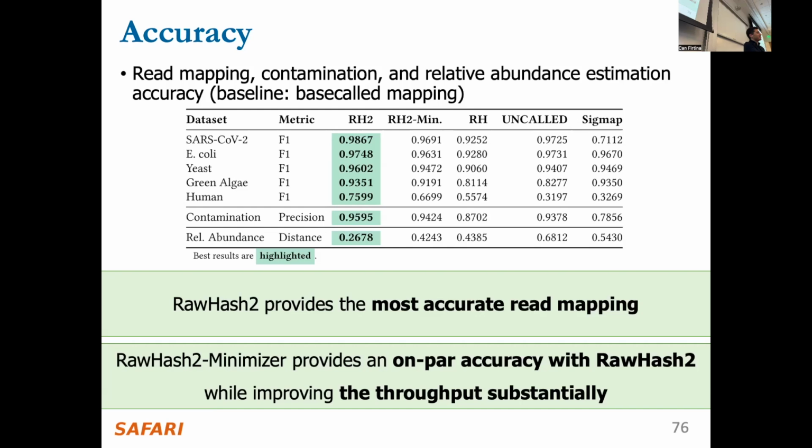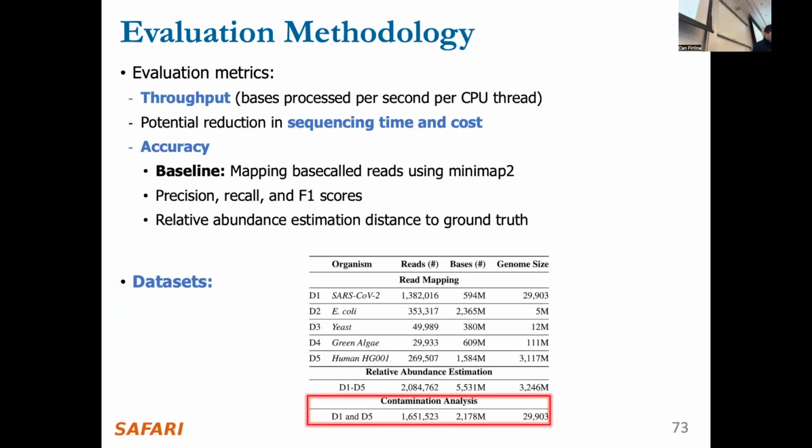I'd also love to see fly up there, because it's something in between in size, between yeast and, I don't know how big algae is. It's 100 million bases, I guess, if I remember correctly. Genome size, yeah, 100 million. So fly might be a good intermediary. It's not anywhere near as repetitive as human, but it's larger. That's a good tip. I agree, another test bed.